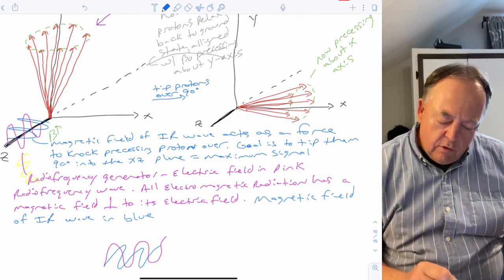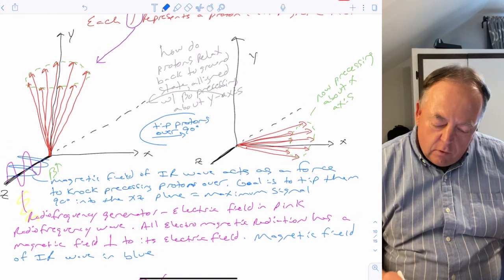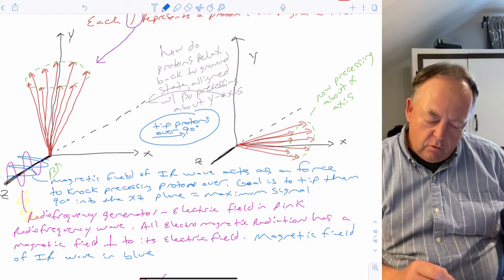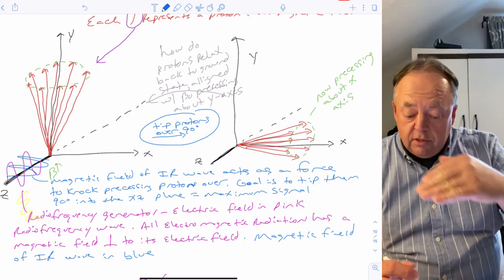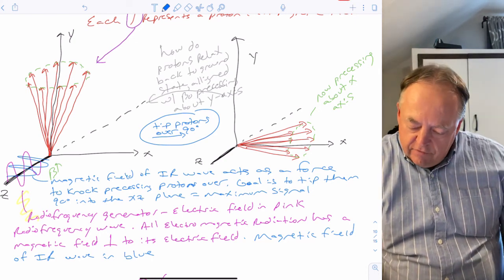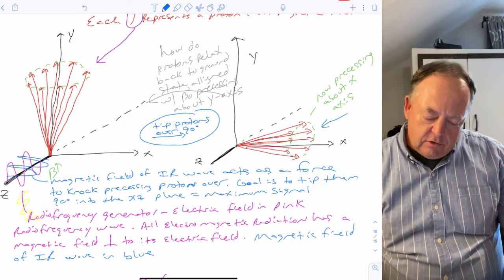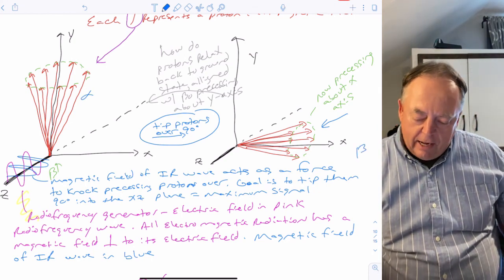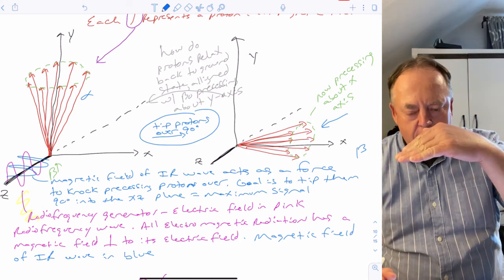When the radio frequency is just right, those protons will absorb this energy and tip over at 90 degrees. It's the magnetic field of the radio frequency that causes this to tip over. The ideal is to tip at 90 degrees, so now you have those nuclei precessing about the x-axis. That's the excited state, the alpha and beta states that we've been referring to. We're not actually flipping the spin totally against the external magnetic field. We're just knocking the protons over 90 degrees.